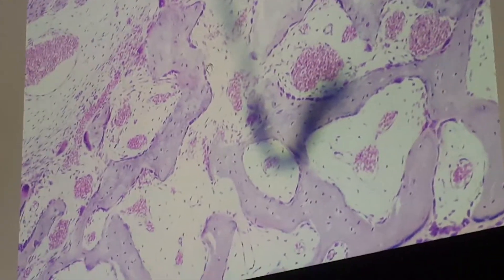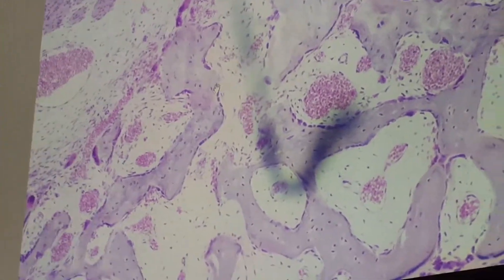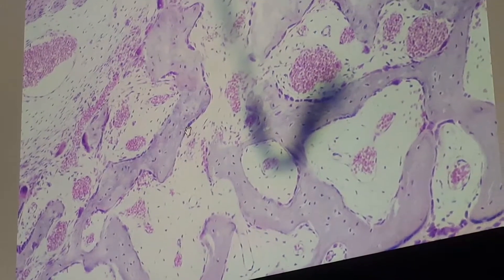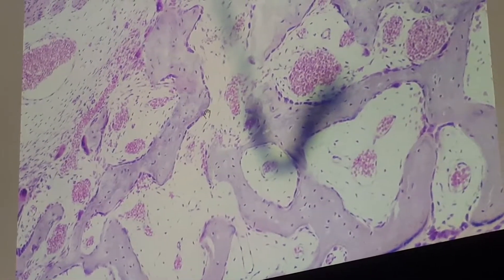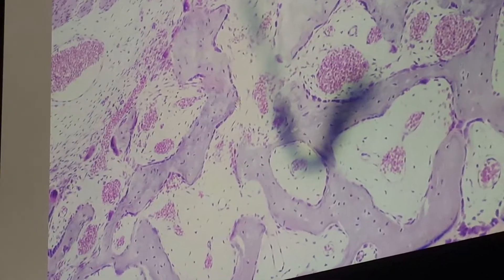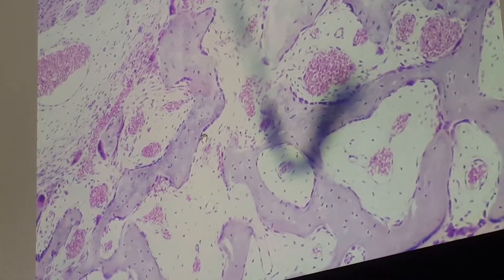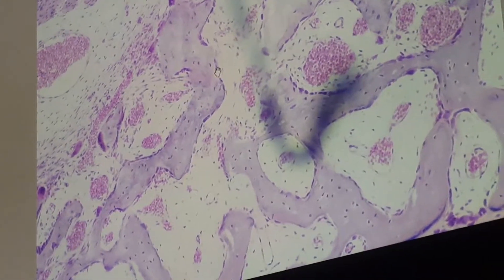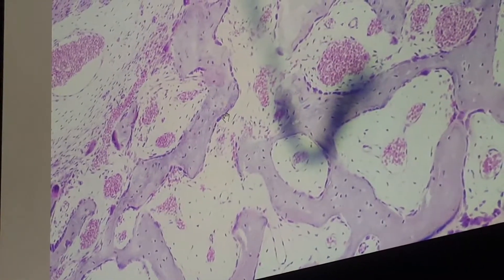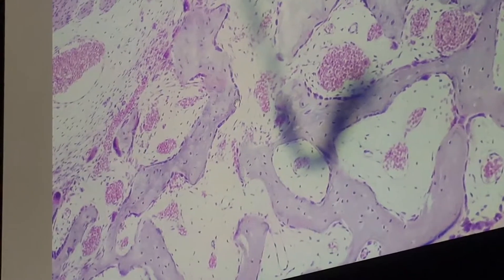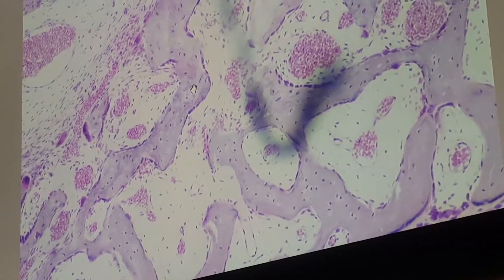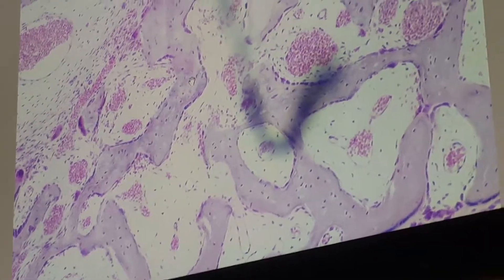At the surface we have osteoblasts. These cells are arranged side by side, resembling simple epithelium. When they are active, they appear cuboidal or columnar in shape. In the center we have calcified matrix.